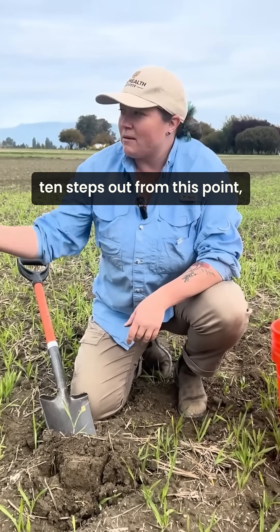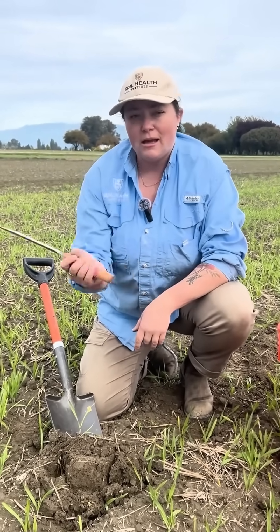Then we're going to get two more samples in this field. We'll walk about 10 steps out from this point, which gives us about a 15-foot radius circle.